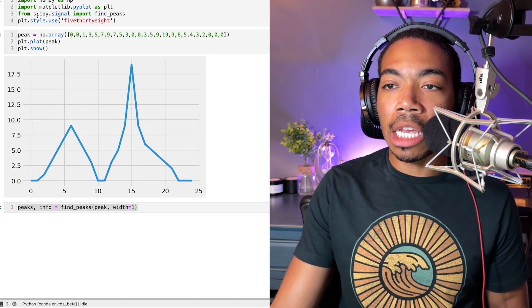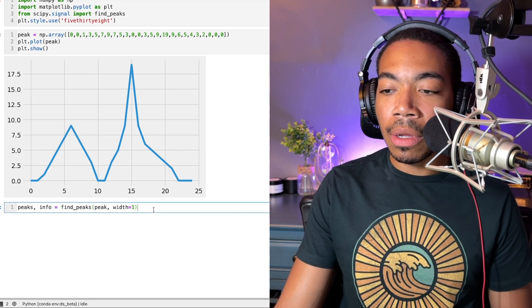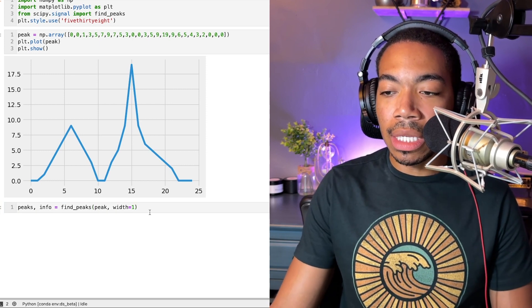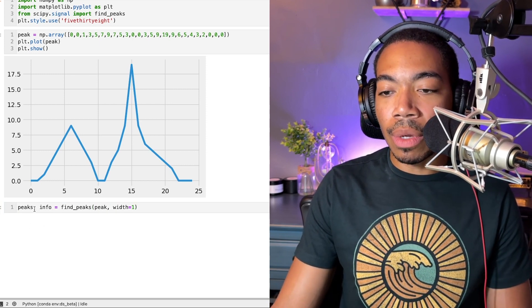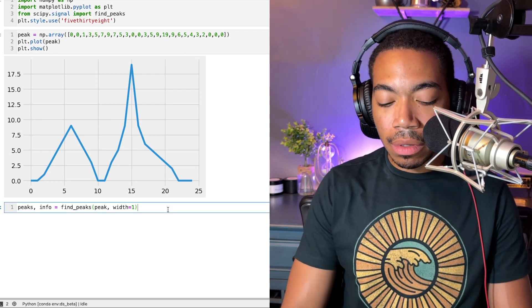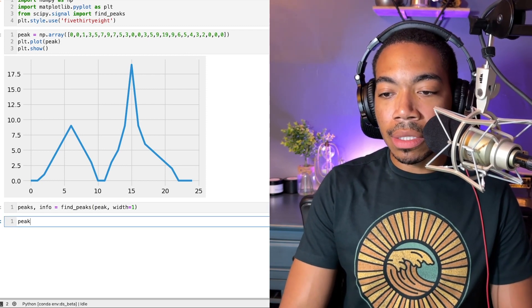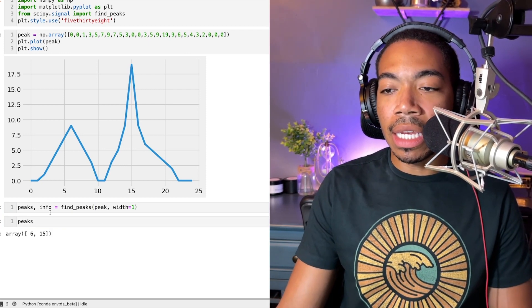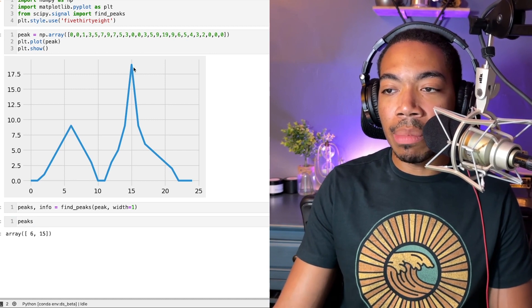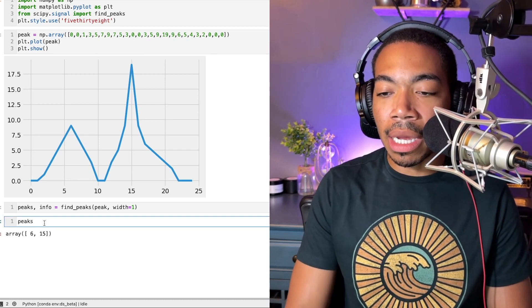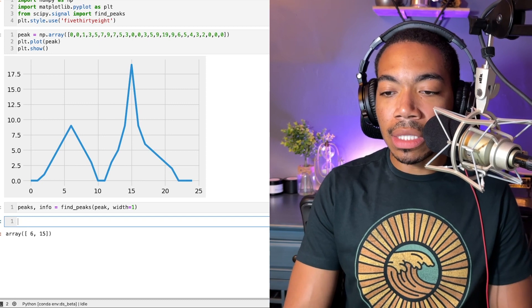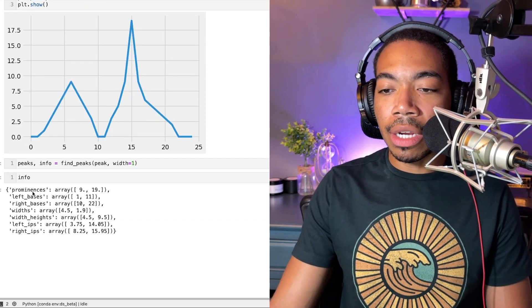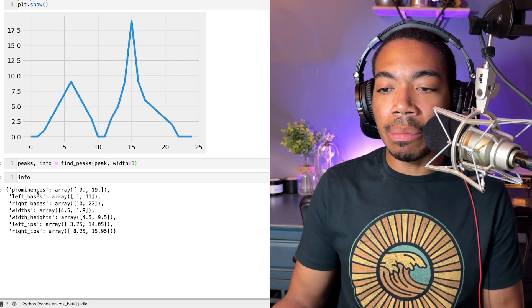Let's do that here. We have two outputs: peak and info. If we look at peaks, you see that we have the index value of where the peak apexes are located with the local maxima. If you look at this info component, we have a dictionary of the metadata of the peak.